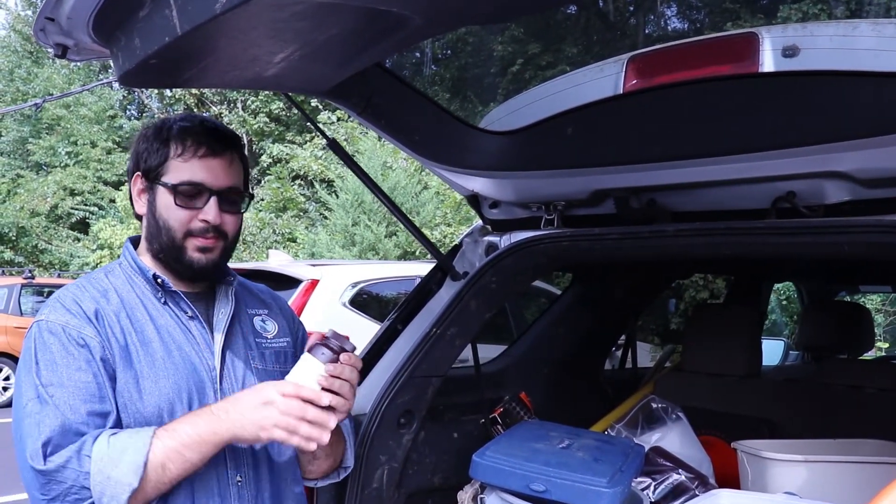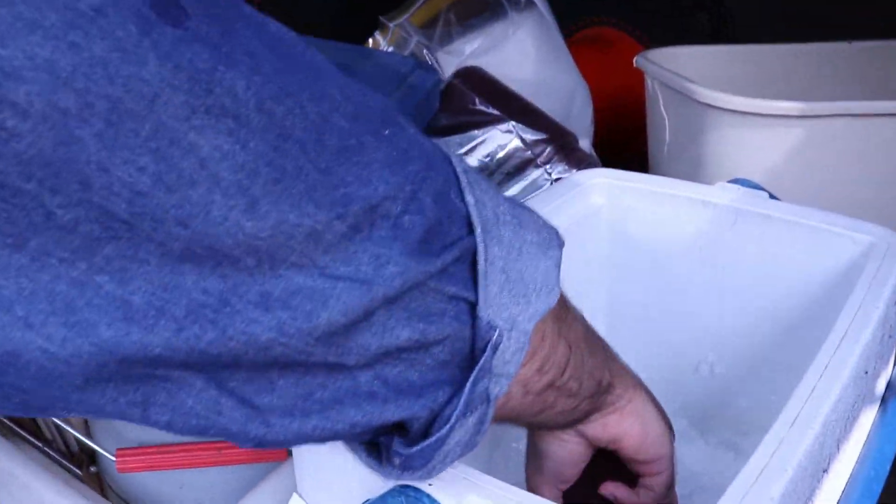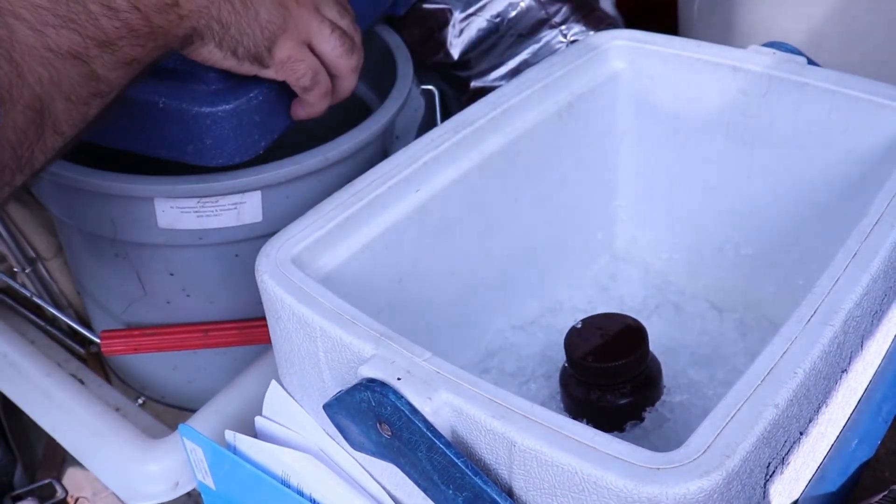Once you've collected the sample and labeled it appropriately, put it in ice. You're going to submit this to the Bureau of Freshwater and Biological Monitoring within 24 hours.